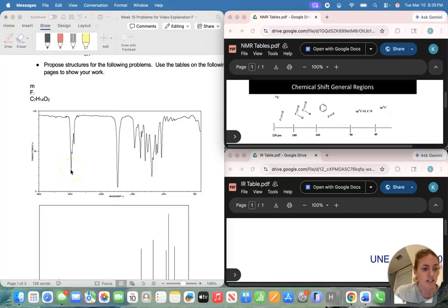So our structure contains 2 oxygen atoms, so the IR spectra is consistent with the potential for a double bond right here, and then with a carbon also bonded to an oxygen over here. So we're thinking now, instead of a carbon-to-carbon or having a cyclohexane or some sort of ring, we're probably going to have a double bonded carbon to an oxygen. The absence of a wide hump here at 3300 would rule out an alcohol or carboxylic acid.